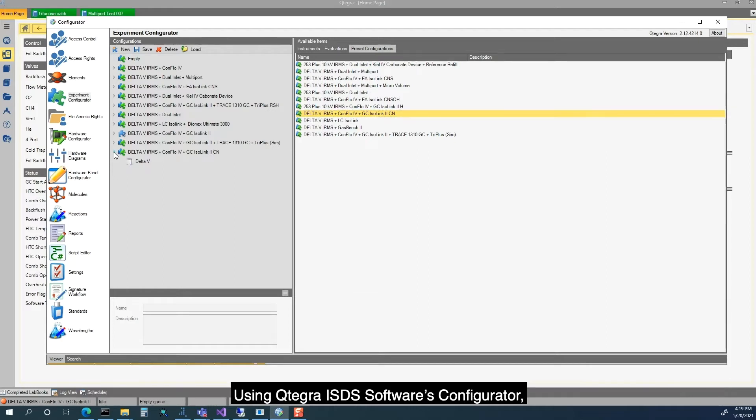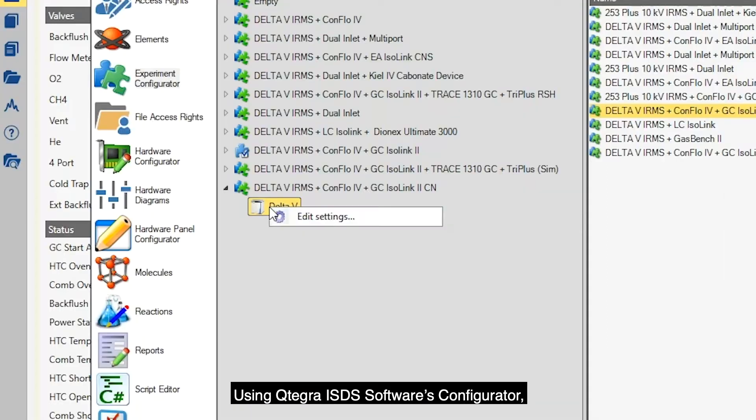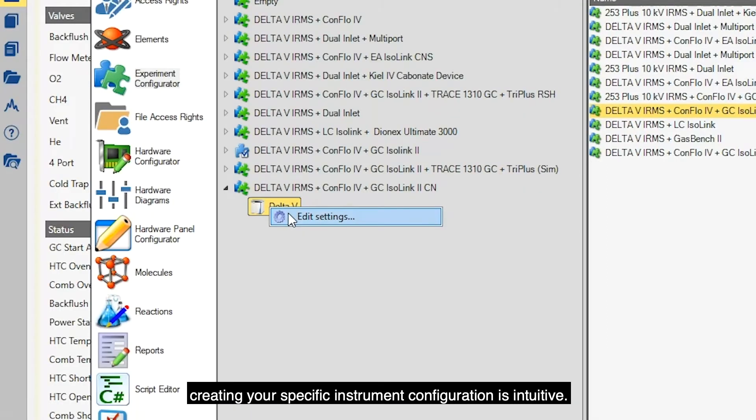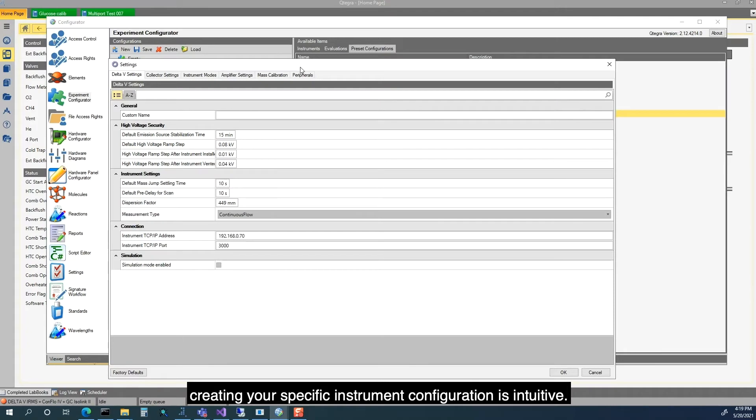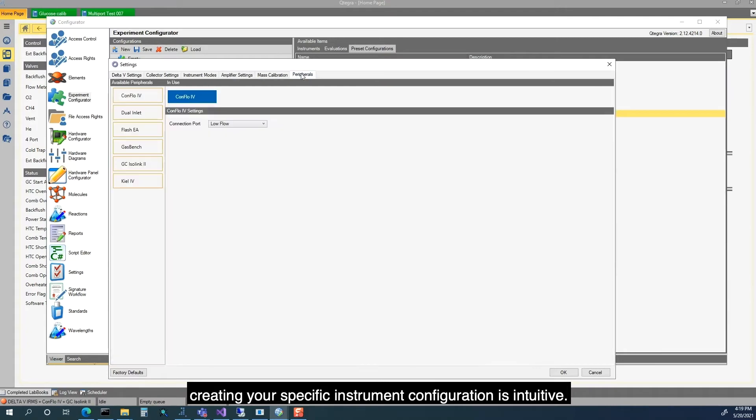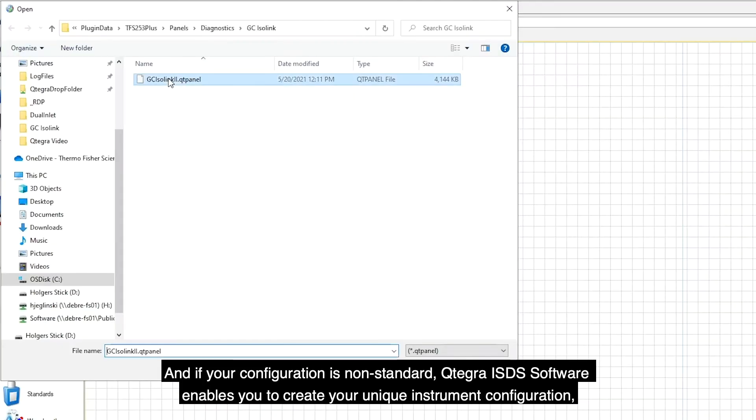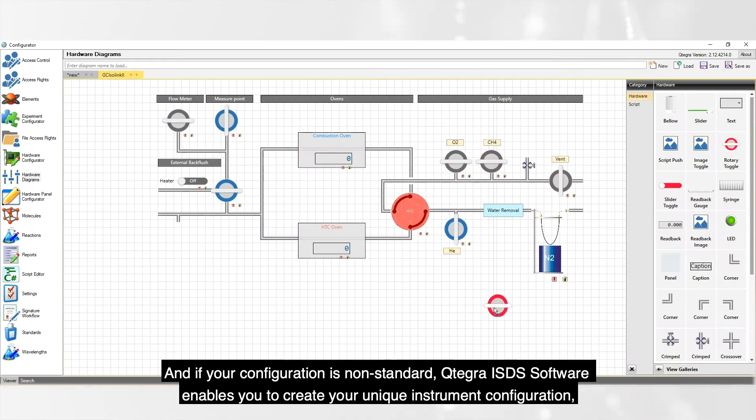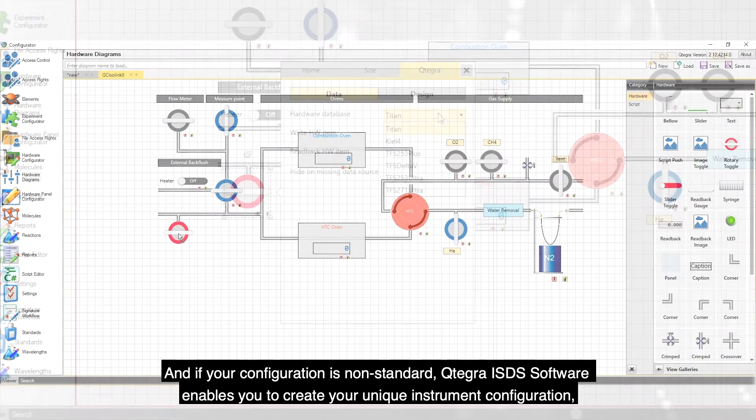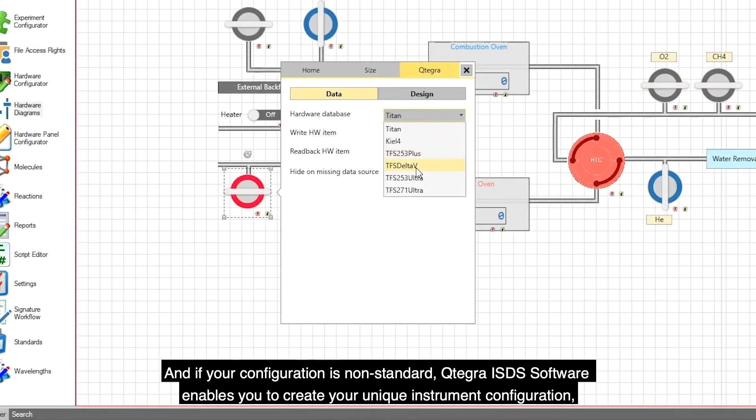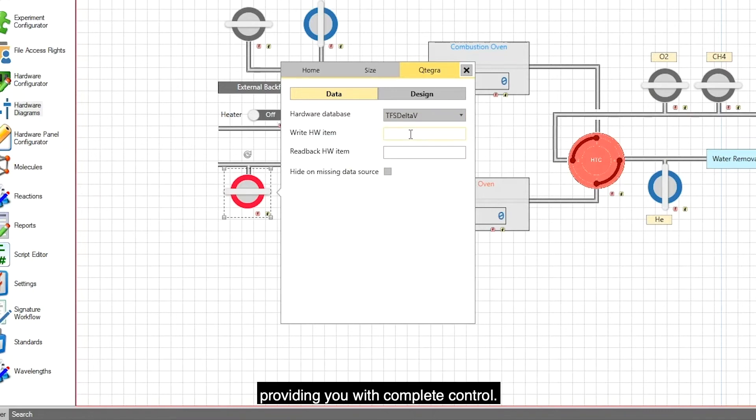Using Qtegra ISDS Software's Configurator, creating your specific instrument configuration is intuitive. And if your configuration is non-standard, Qtegra ISDS Software enables you to create your unique instrument configuration, providing you with complete control.